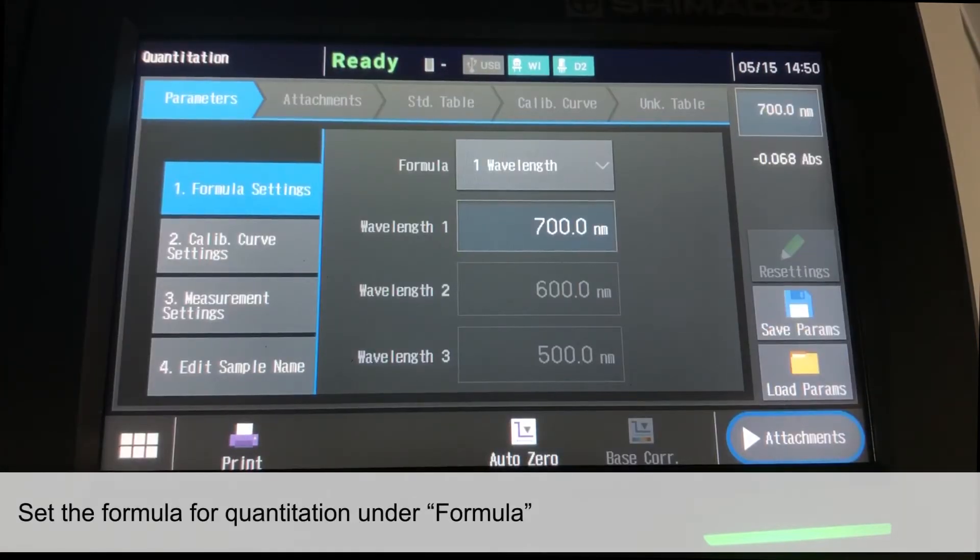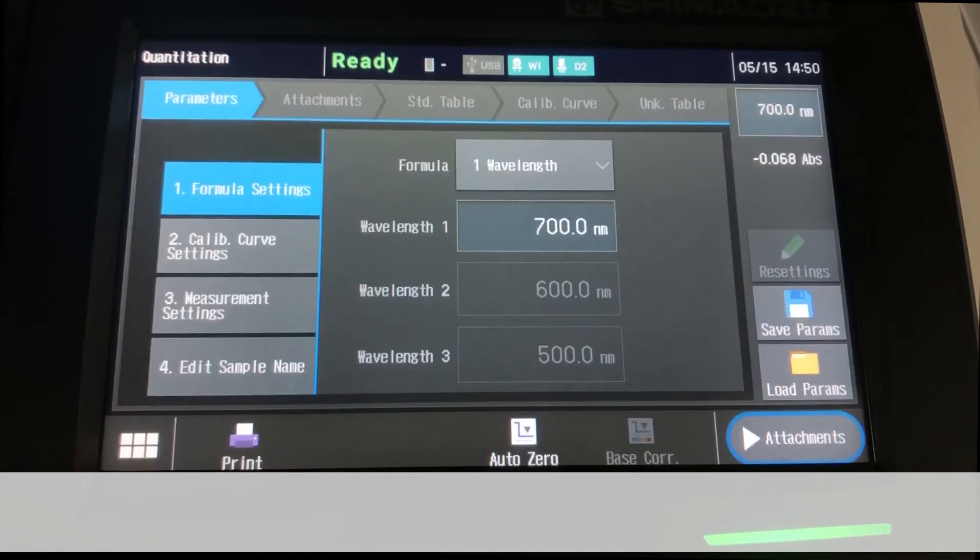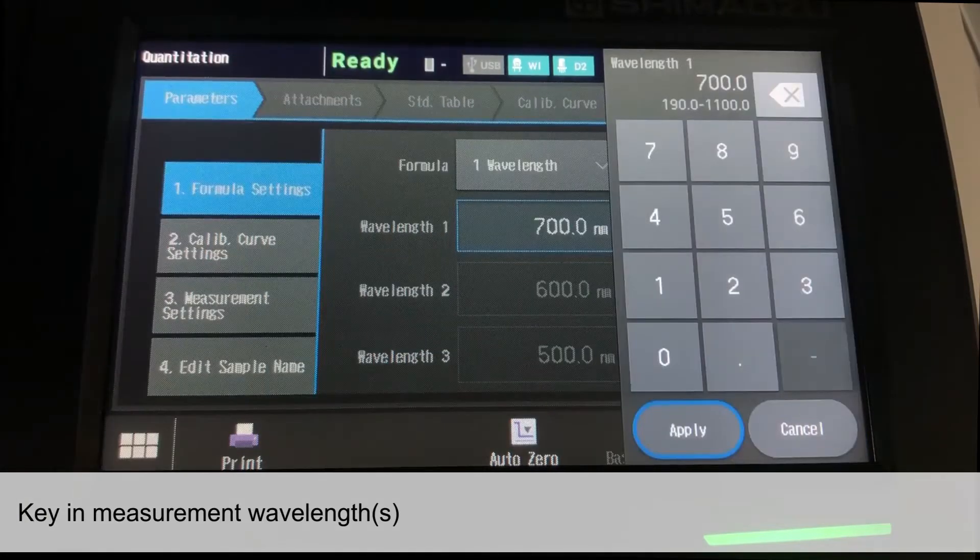Under Formula, set the formula for quantitation. For this example, one wavelength is selected. We will key in the wavelength used for quantitation and select Apply.